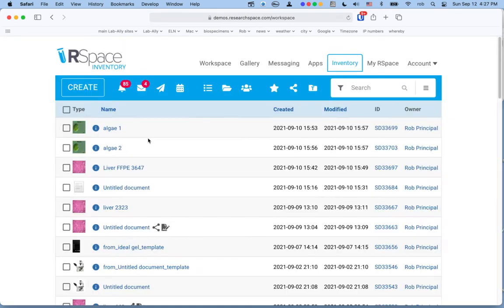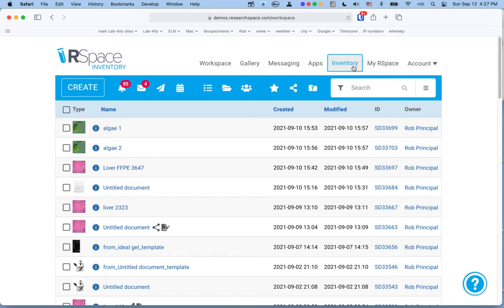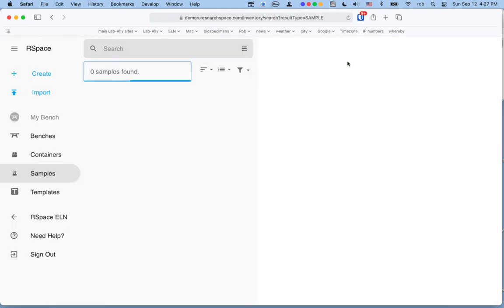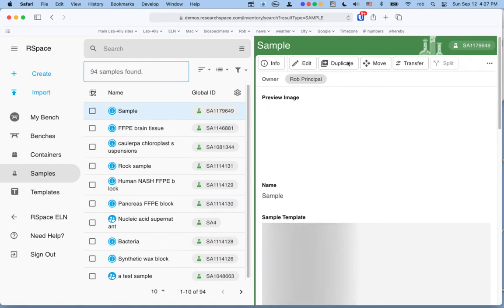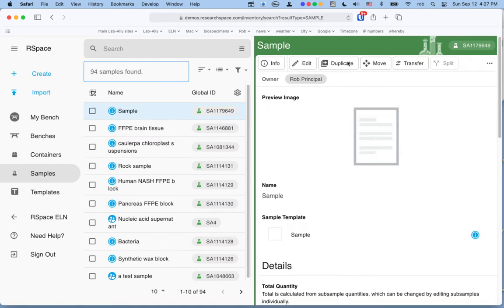I'm going to log in as a hypothetical principal investigator on one of our demonstration servers. When you log in initially, you're brought to the workspace of RSpace. But if you're an RSpace Enterprise customer with your own server, sometime between mid and late September of 2021, this new inventory tab will appear on your interface. You can click on that at any time to go to the new inventory area. From here, you'll need to learn how to use the system and how to set it up in a way that will be useful for your lab.